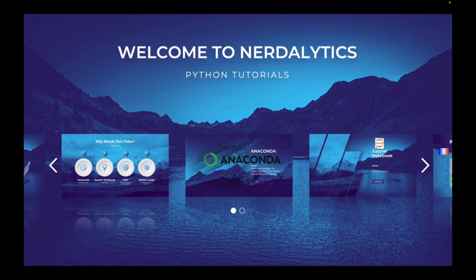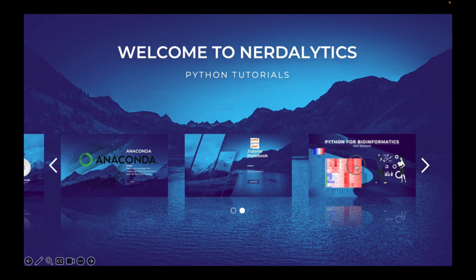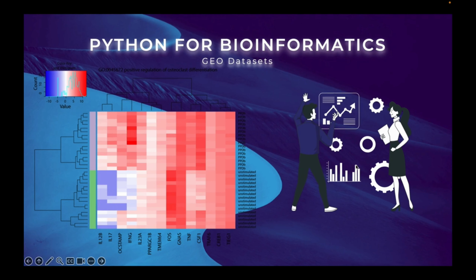And the next thing that we are going to do is start a mini project to write Python code to download Gene Expression Omnibus datasets from NCBI. So yeah, let's begin.